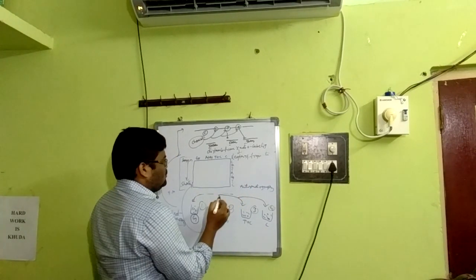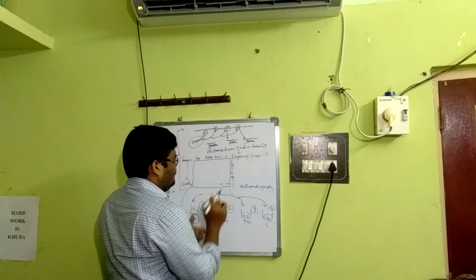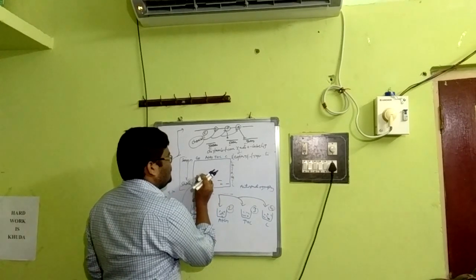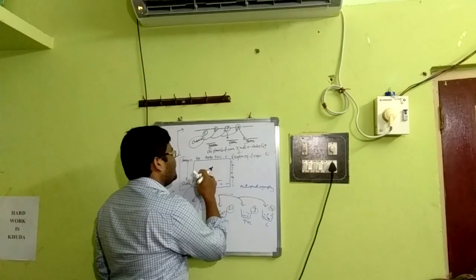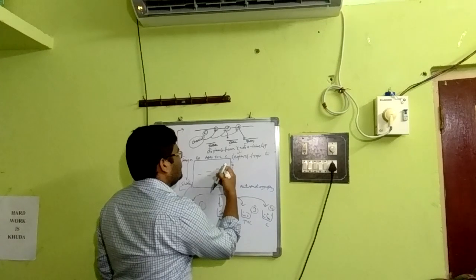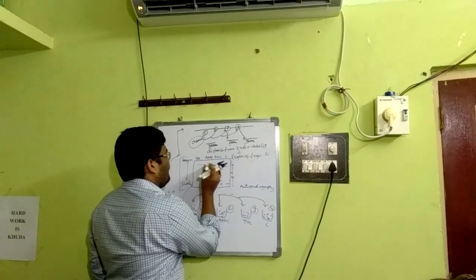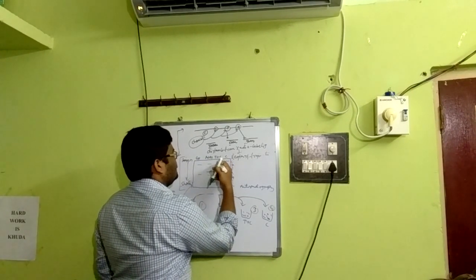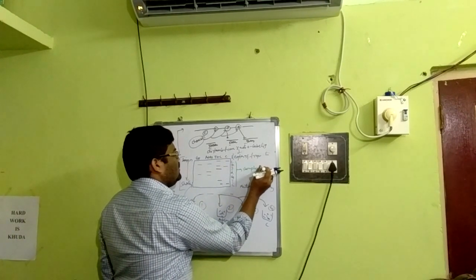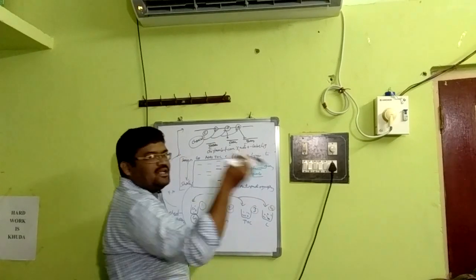Okay, how do we establish this? Say C, then T, then G, then A, then T, then C, then G, then C. It's a complementary sequence with respect to the target DNA sequence.